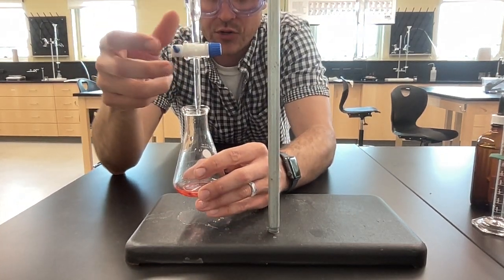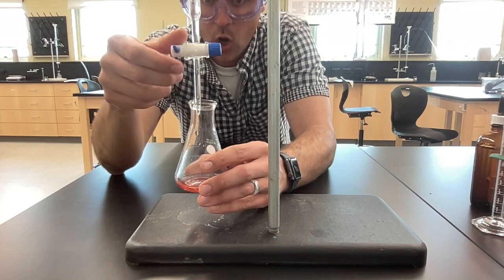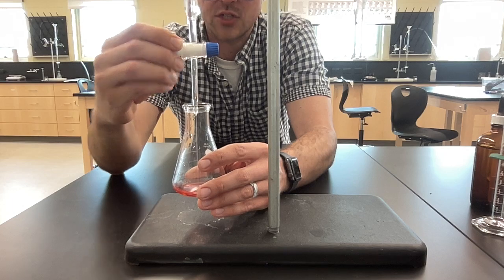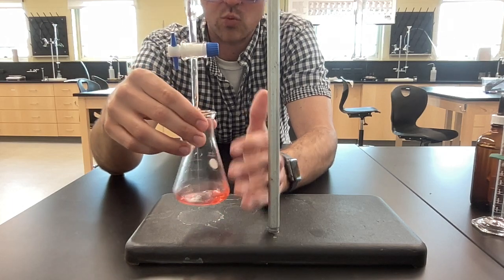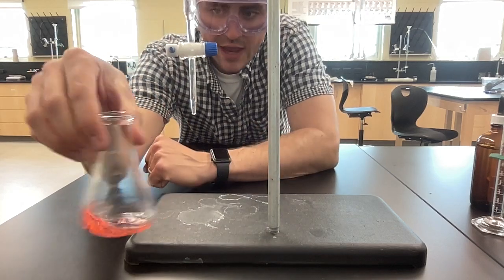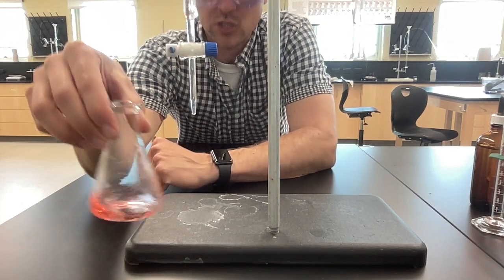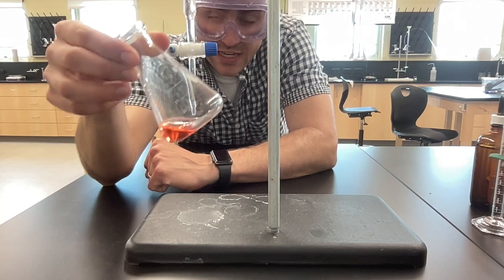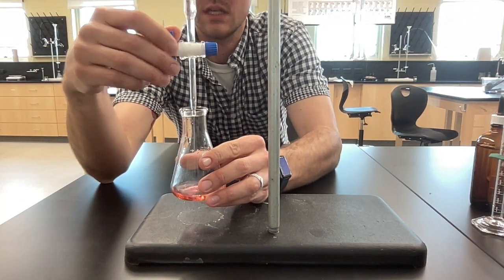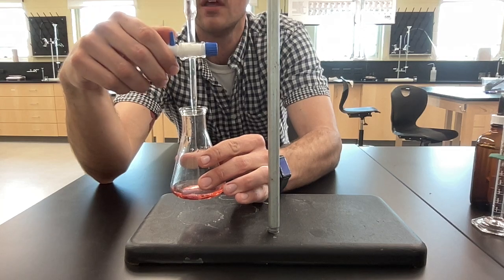I'm going to start by turning my burette open and draining some out, okay? Let's see what we got. As I start to drain some out, I can slowly swirl this, and you see that it still remains red. At this point, I've added about 2 milliliters of base, and it's clearly still acidic. Let's add 2 more milliliters and see if we notice a change.